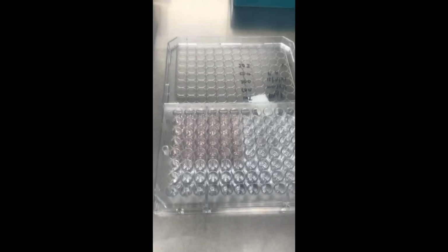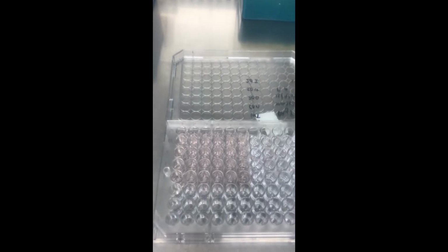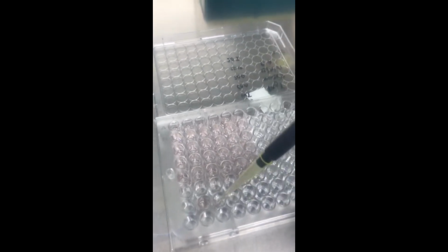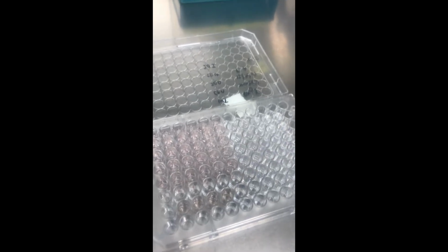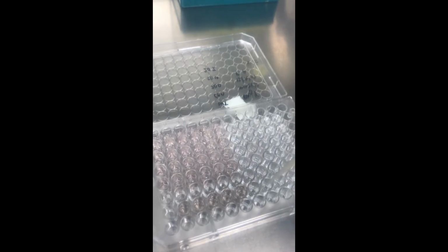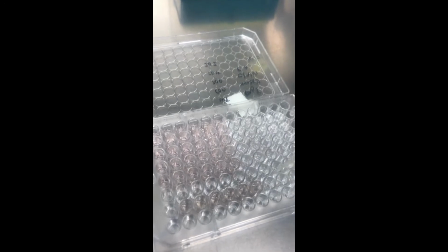Hello everyone, today we're going to see how to perform a cell proliferation assay using CellTiter 96 AQueous One Solution. So here I'm just setting up the controls. I'm using a dilution series. Based upon my cell growth, I chose a dilution range between 40,000 and 800 cells.